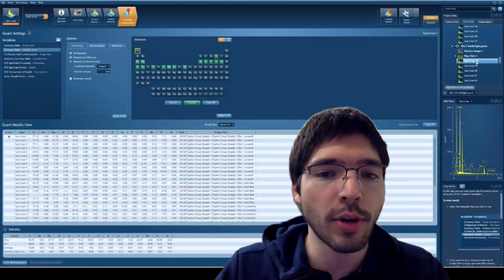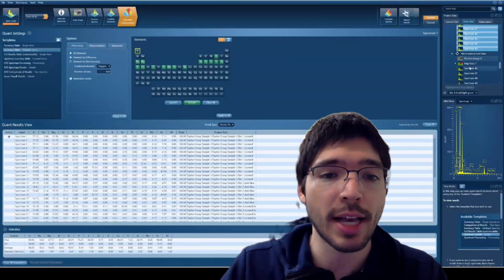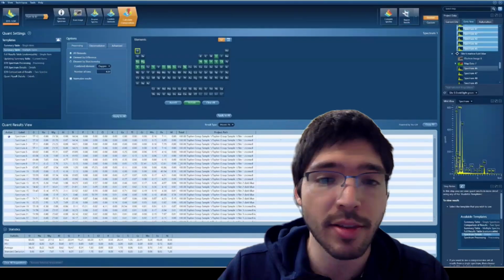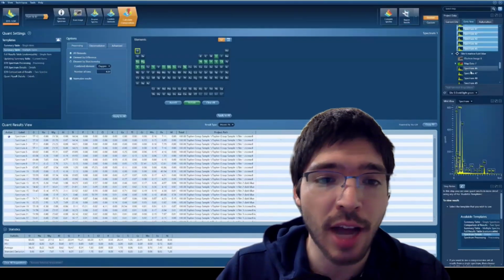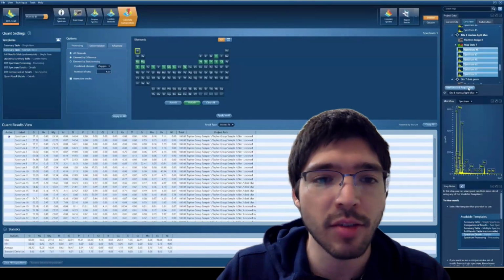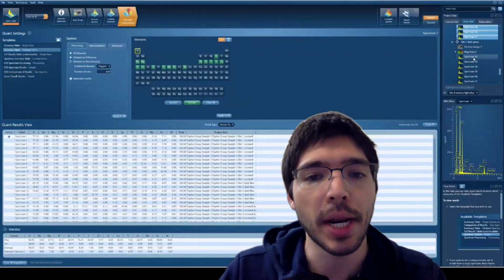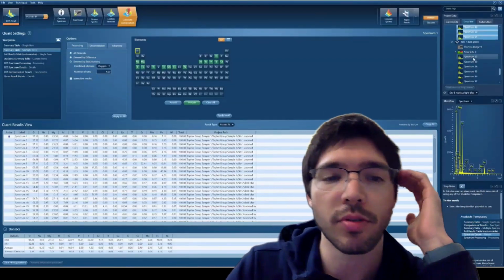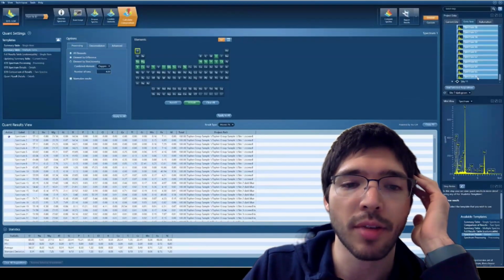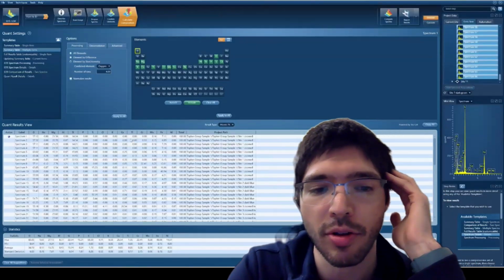This is really good when you're trying to do any kinds of stoichiometric calculations like fayalite, forsterite, the anorthite number you see in lunar meteorites, HEDs, iron-manganese ratios that you see very commonly in the Meteoritical Bulletin submissions of achondrites. This is just the easiest way to do the interpretation and the calculations. But I also export it in other formats too, so you can do elemental weight percent, oxide percent. I'm just putting it all in one place where I can then transfer it over to the spreadsheet.